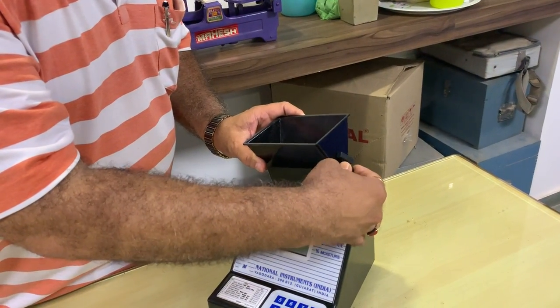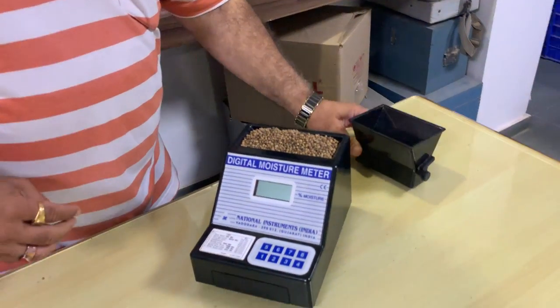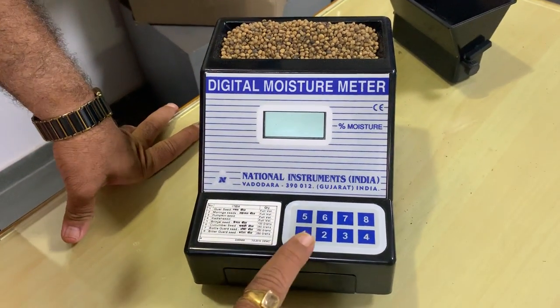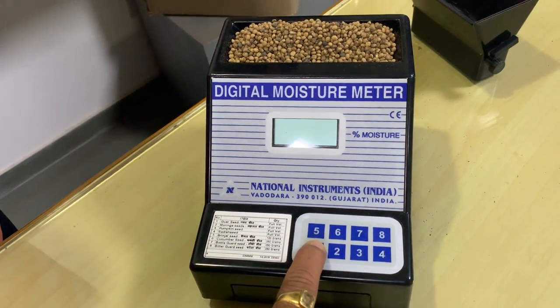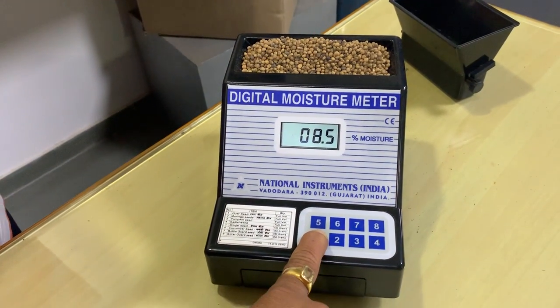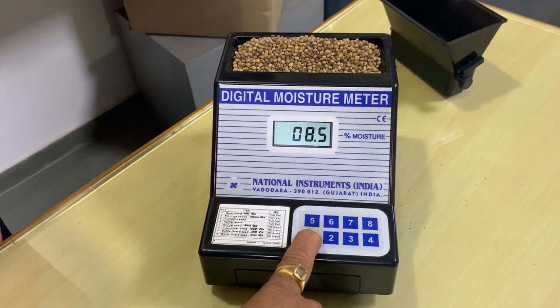Now you can see the whole Guar seed has poured inside the instrument. I will now press the number one key to check the moisture content in the Guar seed. By pressing the number one key, it indicates the percentage moisture inside the Guar seed.